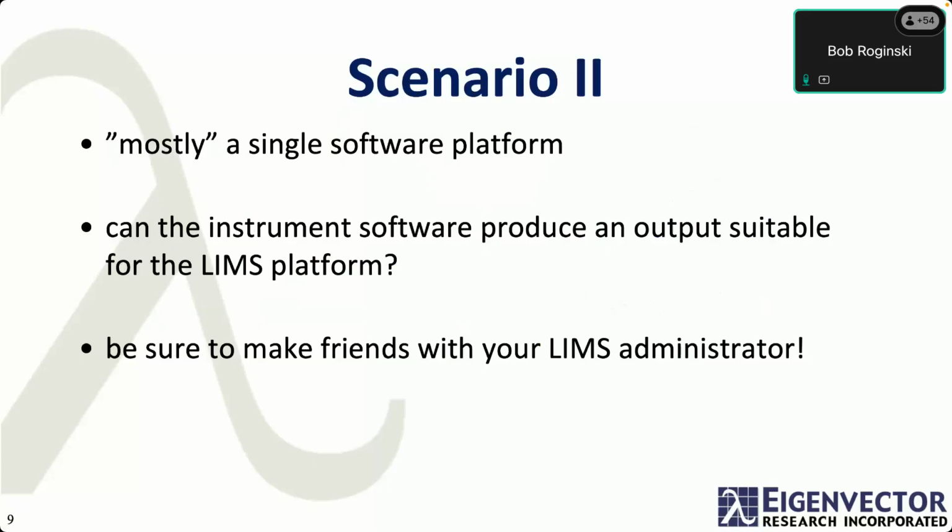Hopefully. And then, a little nudge here, be sure to make friends with your LIMS administrator, because this is the person responsible for the integrity of that system, and you're probably going to need to interface with that person pretty closely to ensure success for your model deployment.